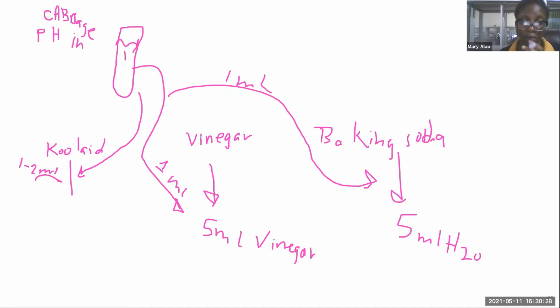So when I do that, I put this indicator in the 50 milliliter conical tube. I take 2 milliliters of that into my first solution. That's right. Then the second step is to record the color change. How do I know the color change? I would see the color become visible. That's right, exactly.